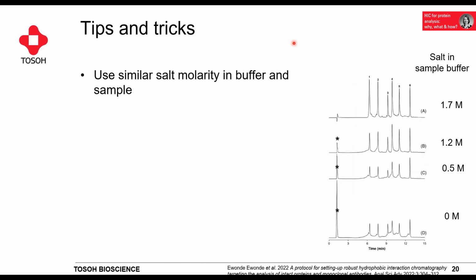And with this, I would just come to some general tips and tricks for hydrophobic interaction chromatography, one of which is it's important to think of which molarity my sample is in before injecting. Because you can imagine you do need a specific salt concentration in order for the molecule to bind. And if you just have it in pure water, for instance, it will not bind at all.